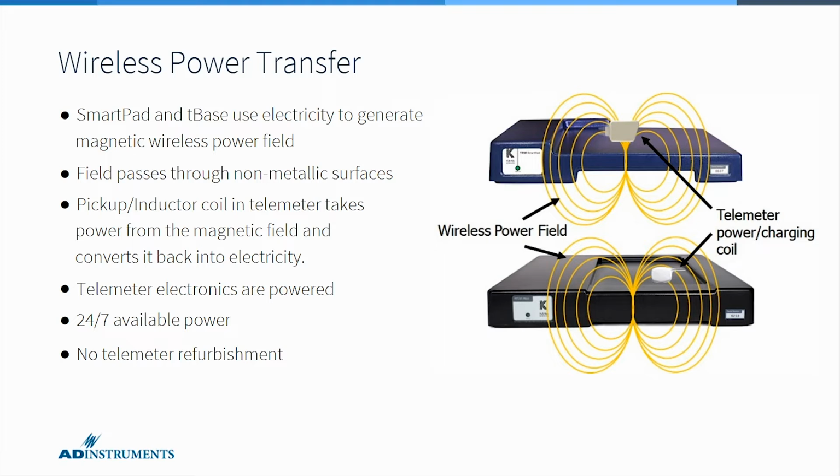During home cage recording, the telemeters are powered continuously, and this opens up the possibility of really continuous recording, firstly, and being able to capture lots of spontaneous physiological activity, but also long-term recording for monitoring physiological parameters over a really long period of time.